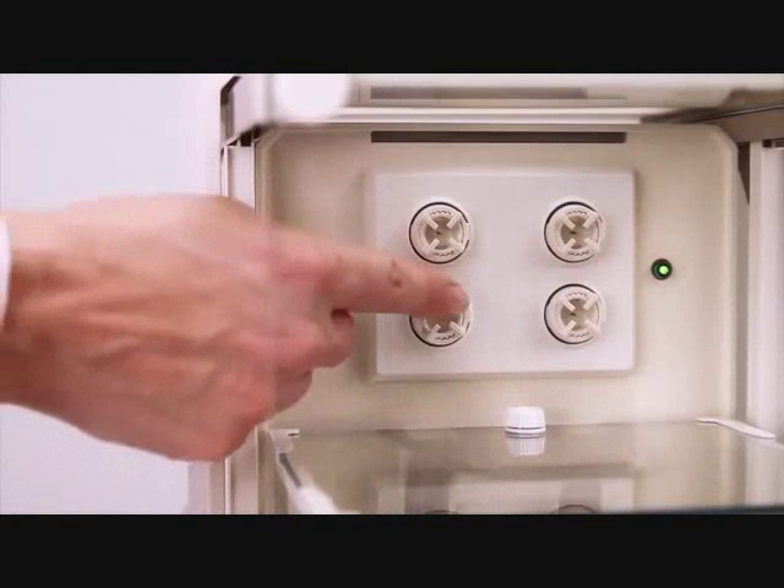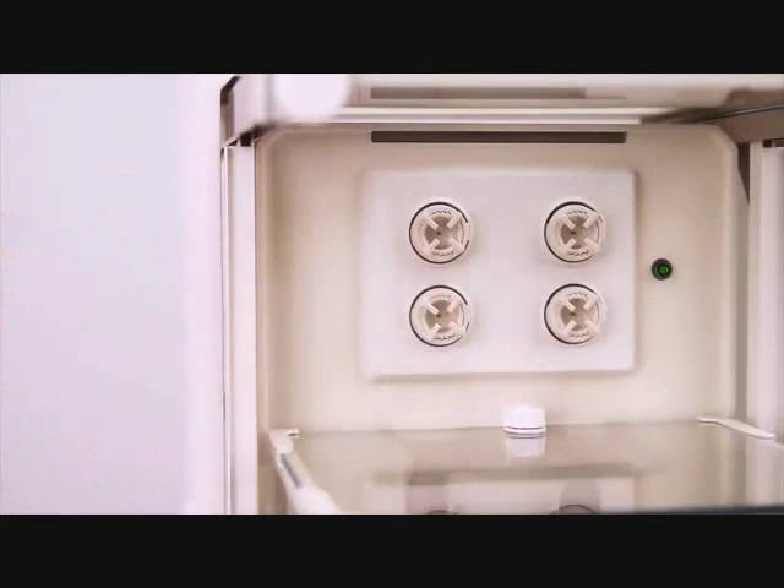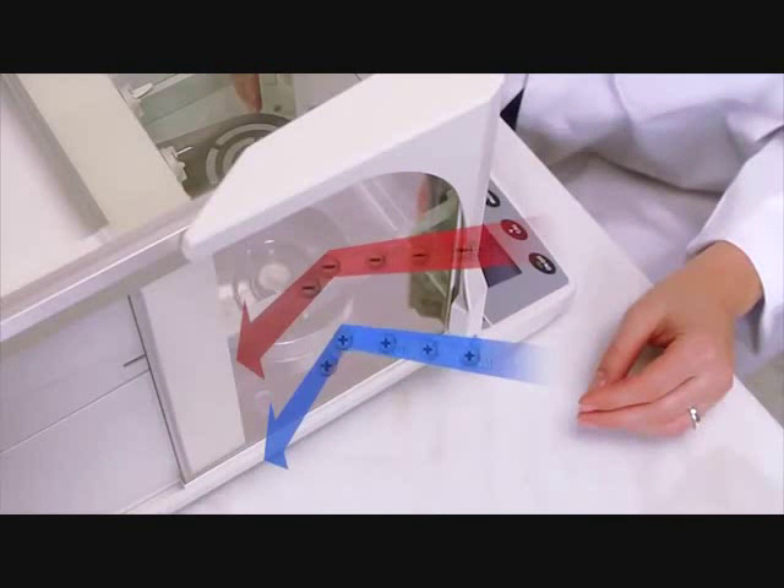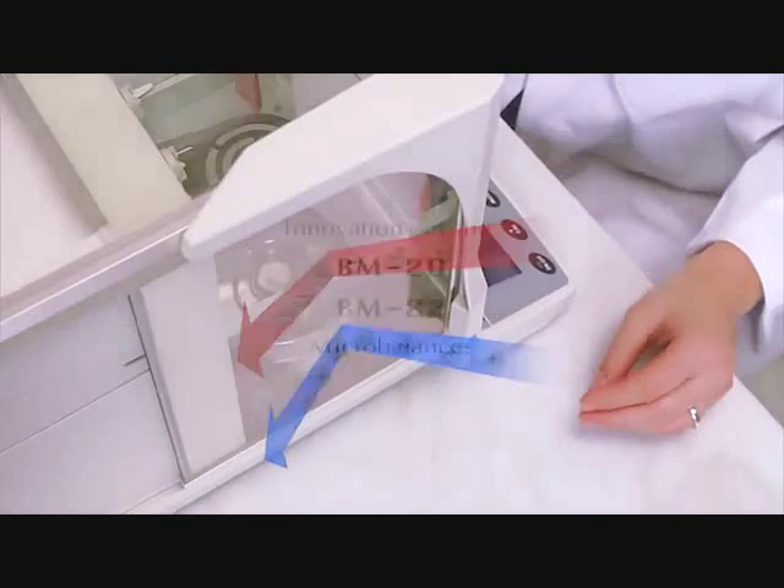The electrodes last 10,000 hours and are safe to the touch. The weighing chamber and doors are all made of anti-static glass.